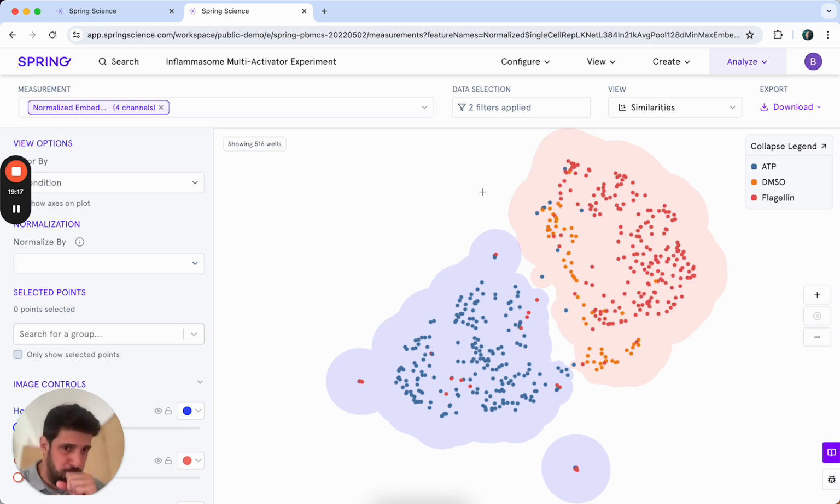So this use case is one where you want to use the power of AI to better understand everything that might separate different imaging populations. Now, I'm going to take you through some use cases that start to answer the follow-up questions that typically come, which are, okay, I see that this population is different than this population, but what is different? Help me understand what's changing. Bring me to some mechanistic understanding here.